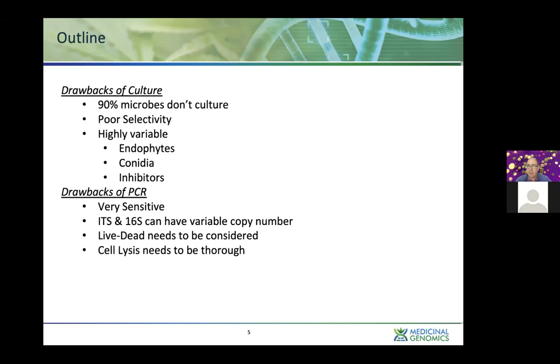That has to do with the fact that the mold tends to be endophytic in cannabis. It grows inside the plant and is vascularized in the plant, and you can't get that out of the plant without lysing open cell walls. And fungi have cell walls and cell membranes. So you're typically lysing open both when you want to get access to the endophytes.